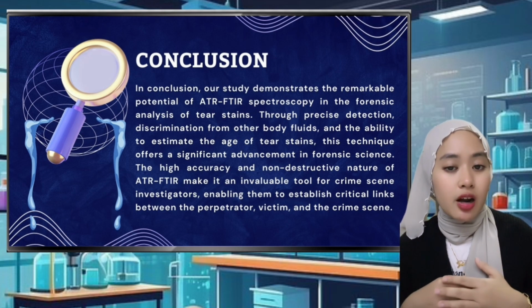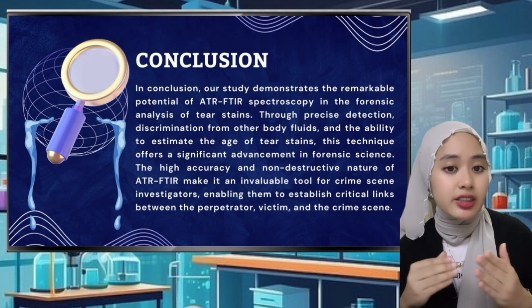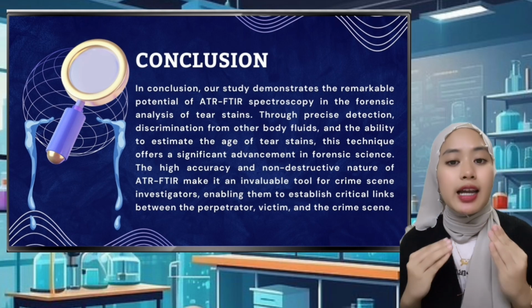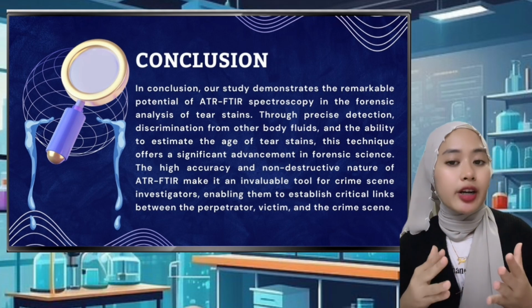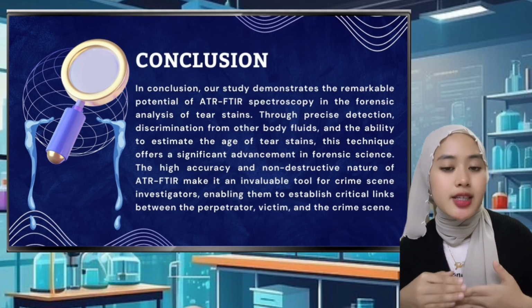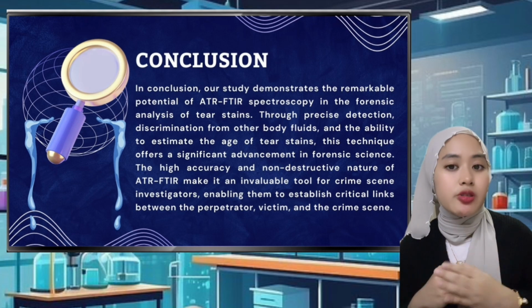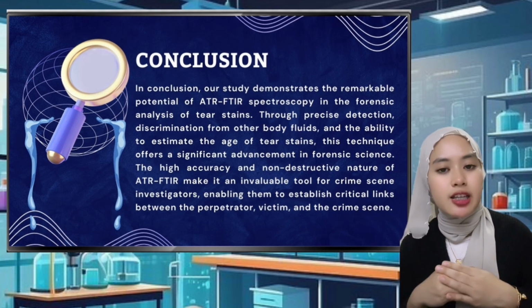The obtained spectra from all the body fluids were analyzed by PCA-LDA, discriminating them in their respective classes with 100% accuracy. These results are highly significant for the discrimination of tears at the scene of crime by using ATR-FTIR spectroscopy from the other fluids. Further, in this study, the spectral changes in the tear stain over a longer time period were observed to investigate the potential of this fluid as an age marker at the crime scene.